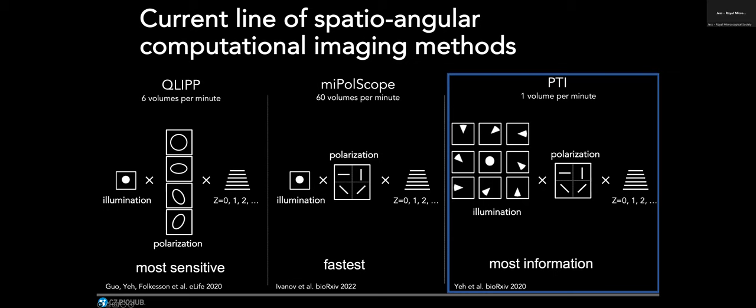in depth. In our design, we have the analogous issue where we control the polarization states or analyze the polarization states in the XY plane, but not out of the plane. And as a result, the anisotropy measurements are projected into the focal plane. And we know that biology doesn't follow Cartesian coordinates, it has its own internal coordinate system. So it's really valuable to be able to measure the 3D anisotropy, the out-of-plane component of the anisotropy.